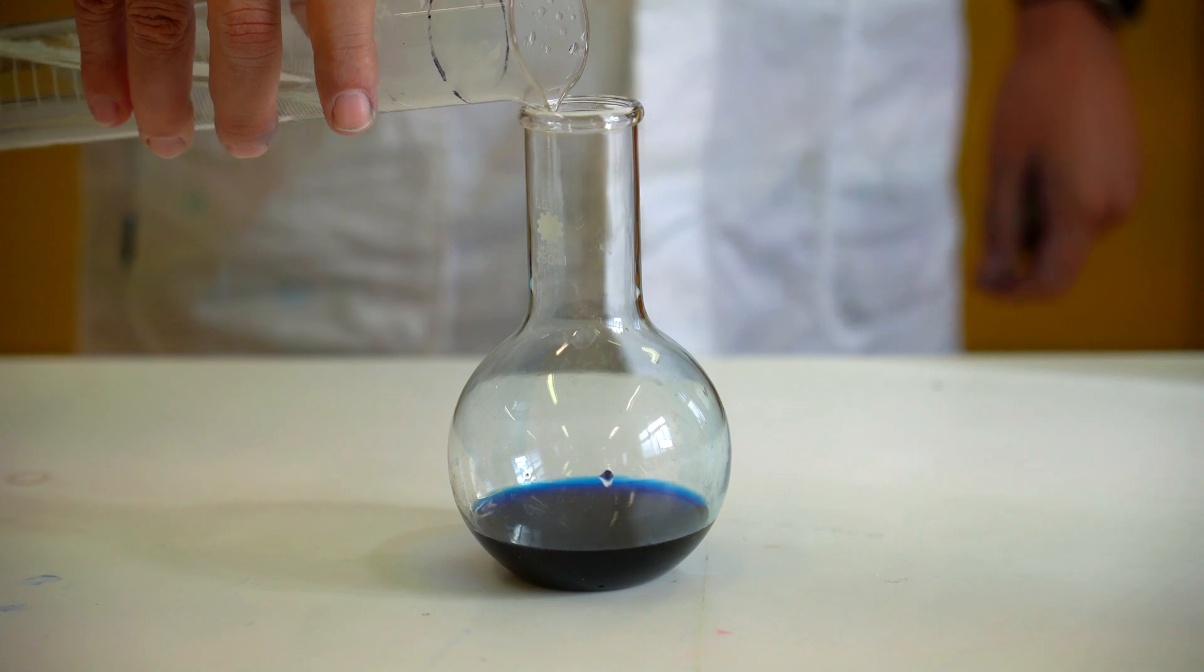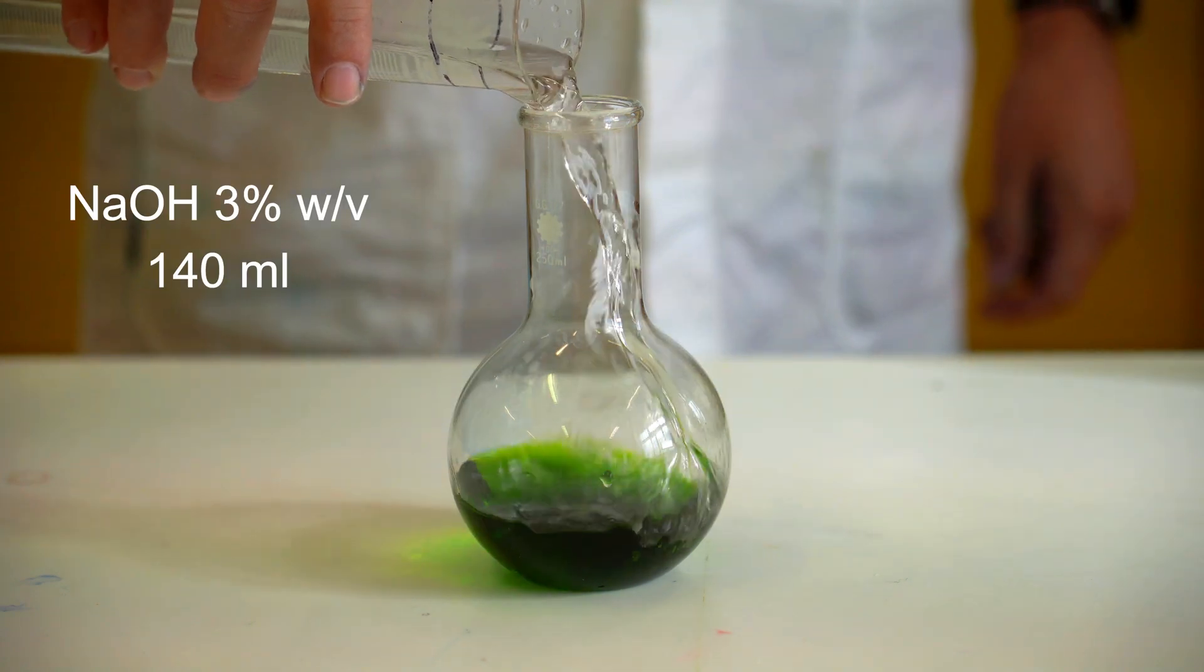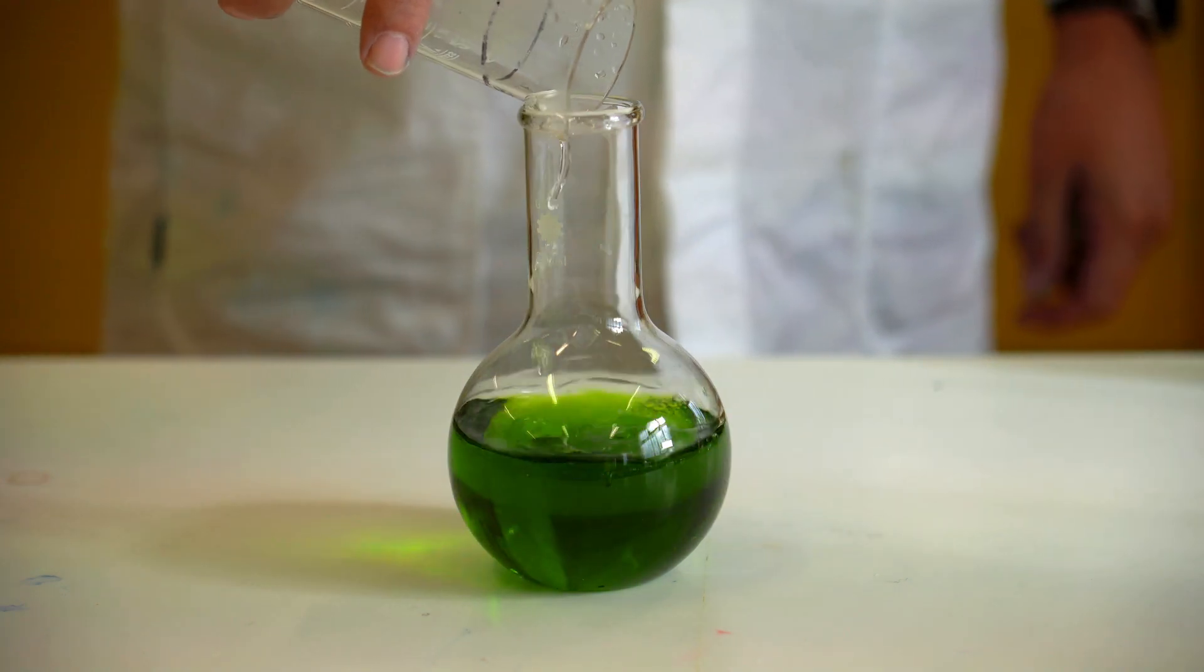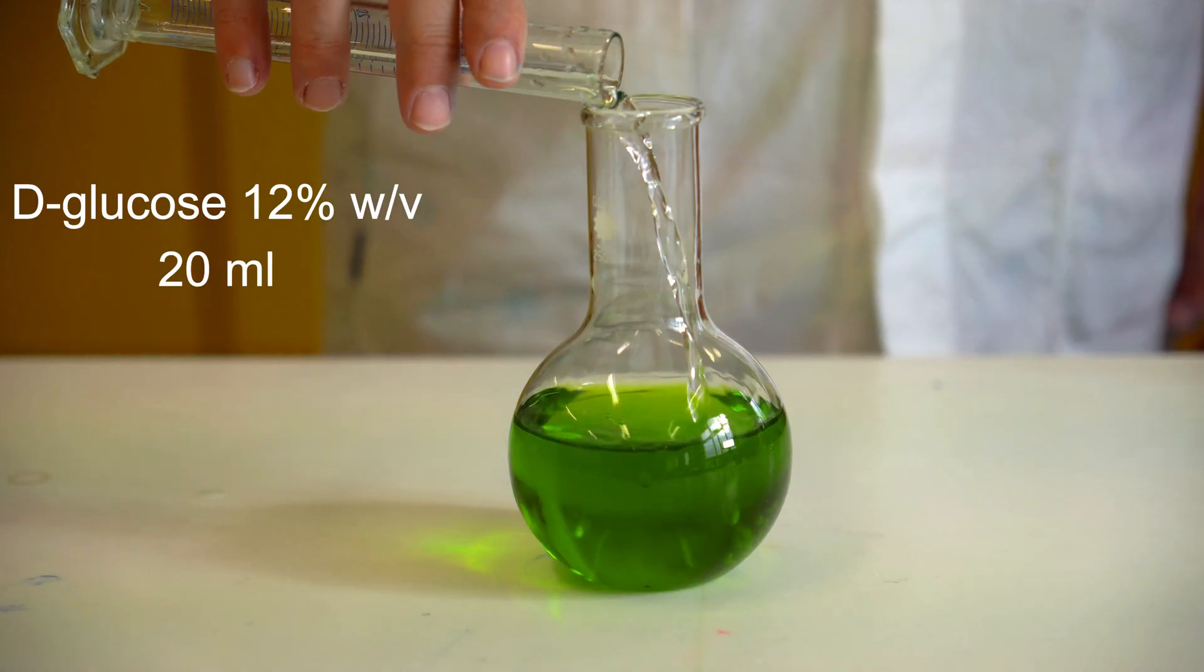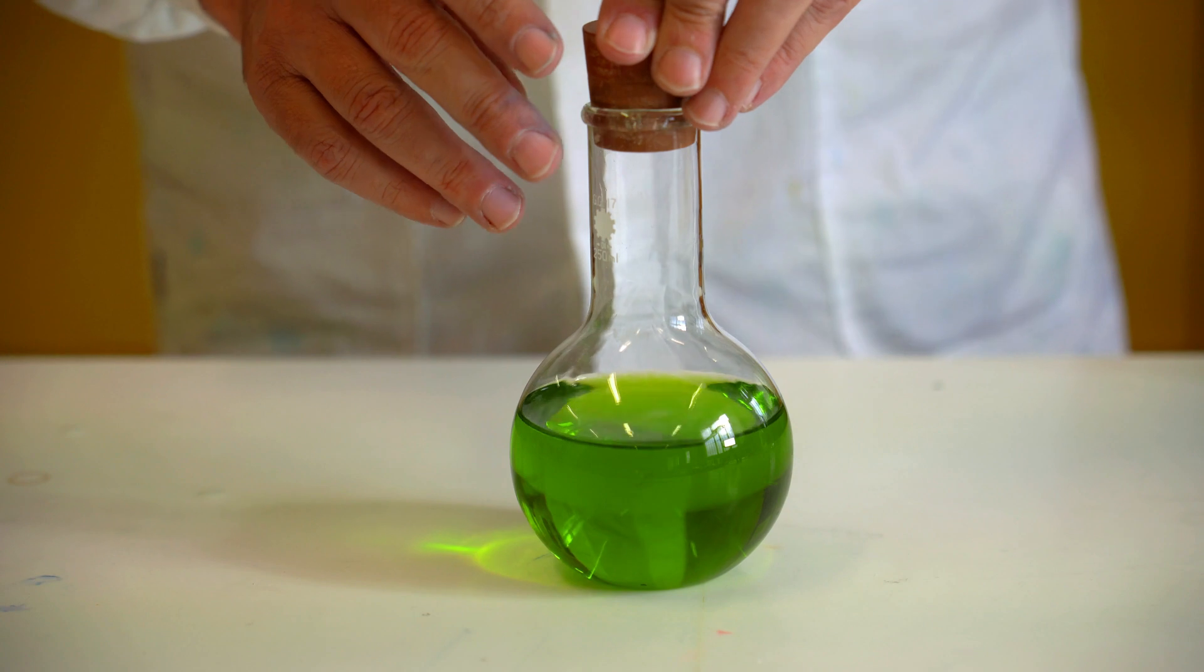40 ml of indigo carmine solution followed by 140 ml of sodium hydroxide. Indicator becomes green in such a high pH. Then, 20 ml of glucose solution are added.